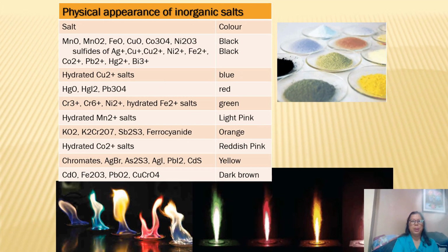These are some physical appearances of elements that are tested for flame tests. These are watch glasses, and these are also special burners to test for flame tests.